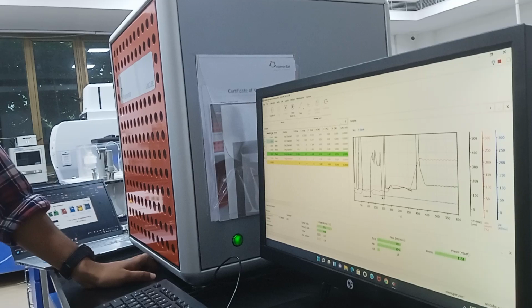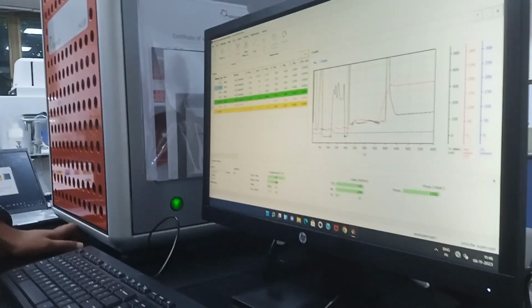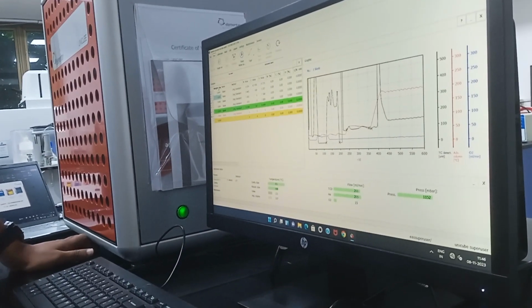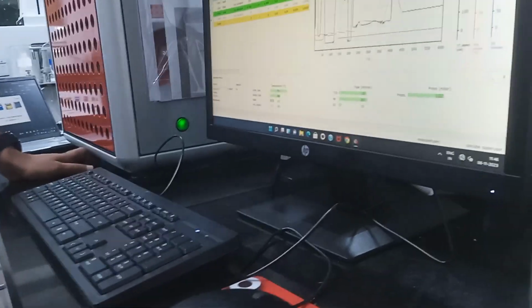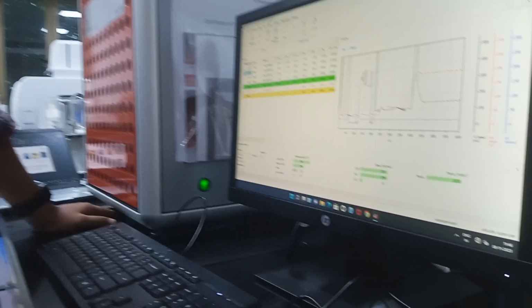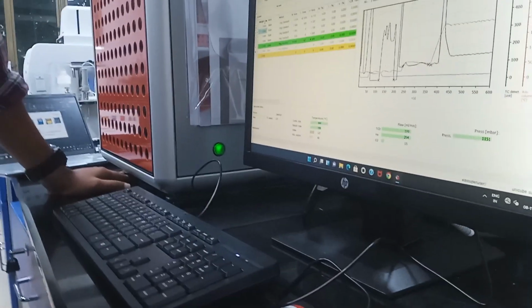This is for this one. If it is 0, the instrument will throw an error like sample weight is 0. The internal calibration value is already given, you understand? Okay, that is what they are saying. If someone wants to manipulate the data, the converter will show some error. If you do want to manipulate, just take the CSV file and do it in Origin. That will give you better manipulation.